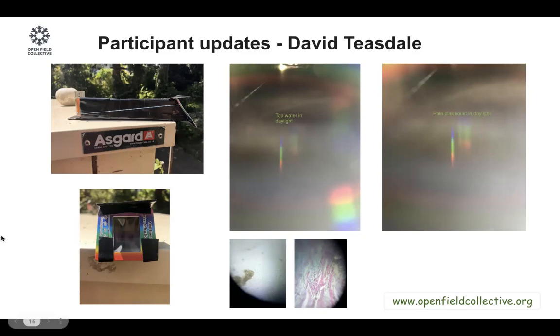Yeah. Can I ask another question? Looking at the samples I've got, quite a number have macro amounts of green material in them, presumably algae, but might be some plant vegetation. Do we need to sieve the samples in any way before putting them in the spectrophotometer?